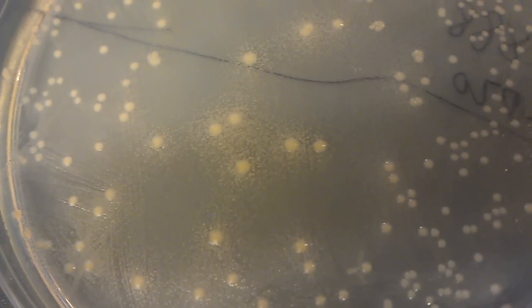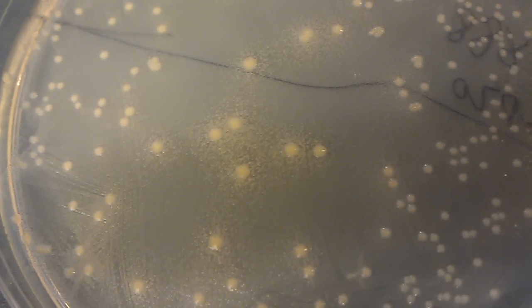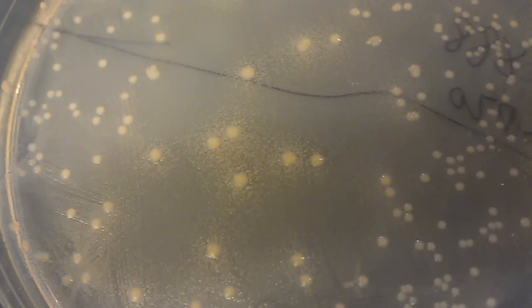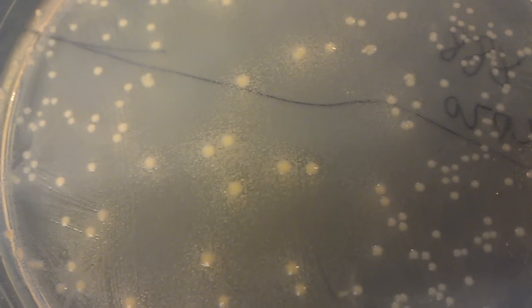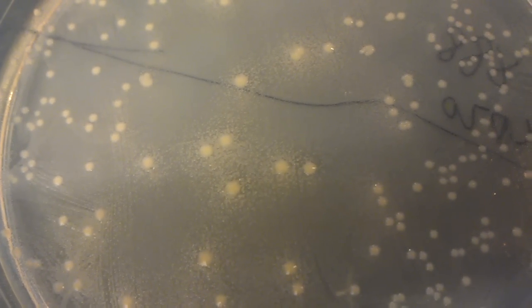Otherwise, you're going to take like a 50% hit in how much ampicillin you have there. Also, if you leave your plates out at room temperature for too long, then it's going to start to degrade. Also, if you leave your plates out on your bench, the lights from your lab, or if you have windows, we do not, if you have windows, then the sun might come and degrade it, but definitely the lights in your lab will degrade it.